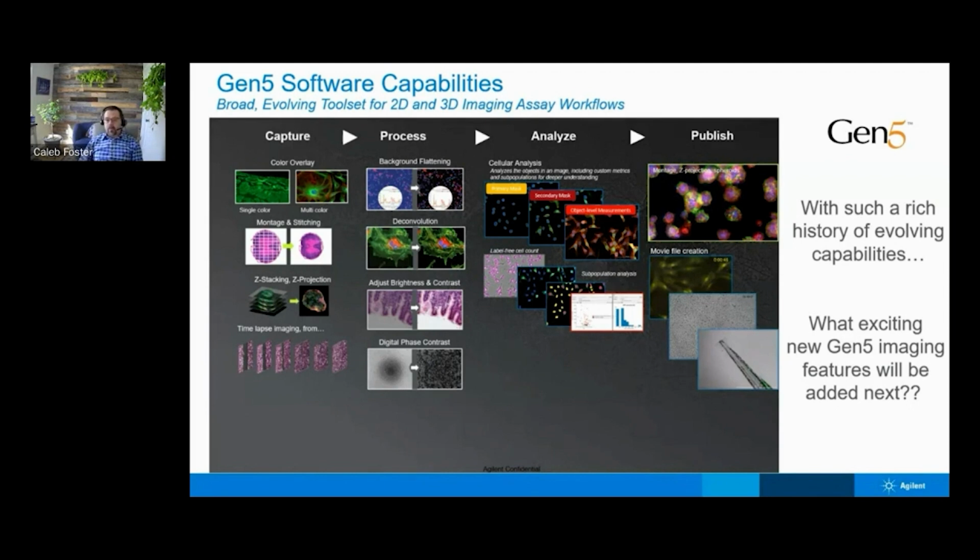Our imaging systems, we have both confocal and wide field systems. The best resolution will be gained by confocal, which is in our Cytation C10 platform. And confocal gets rid of out of focus light, so it can resolve better in a single plane of an image. We can image up to 60x on the C10.